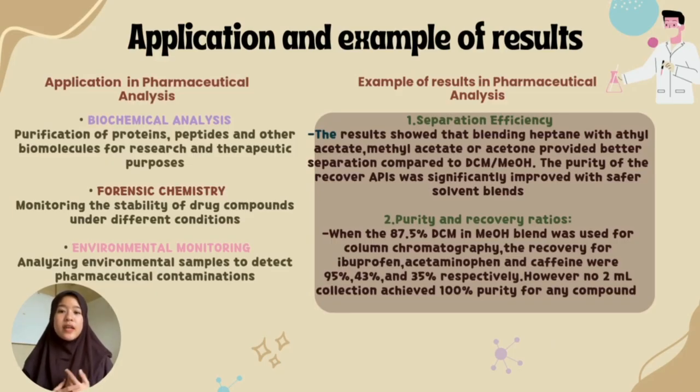Next, I will explain about applications in pharmaceutical analysis. First, biochemical analysis. Purification of proteins, peptides, and other biomolecules for research and therapeutic purposes. Second, forensic chemistry. Monitoring the stability of drug compounds under different conditions. Lastly, environmental monitoring. Analyzing environmental samples to detect pharmaceutical contamination.